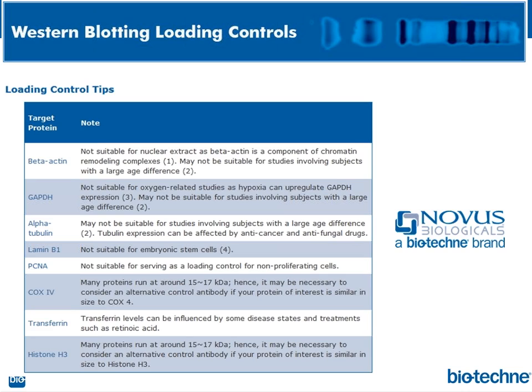Okay, and then we've got two more questions left. So it looks like Megha asks, in the proteome array, how can you recognize the proteins as there is no ladder? Oh, in the proteome array, yeah. So this is a kind of a relative type of approach, and really what you're doing is you're not size fractionating the proteins via a gel and then transferring. So this is really, how can I put it?